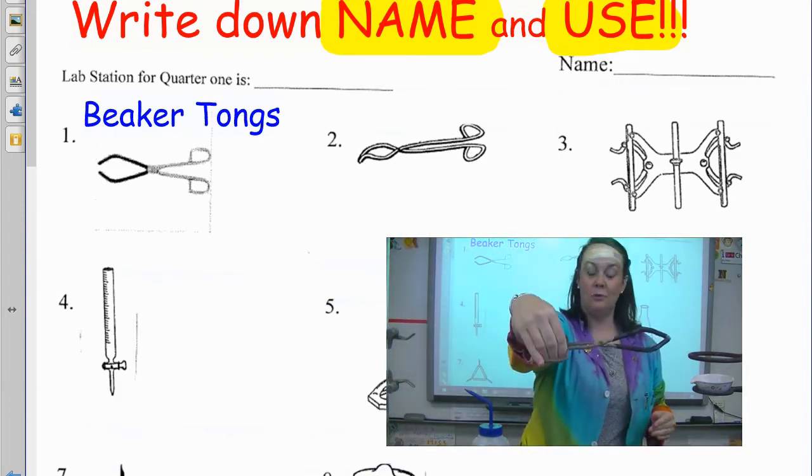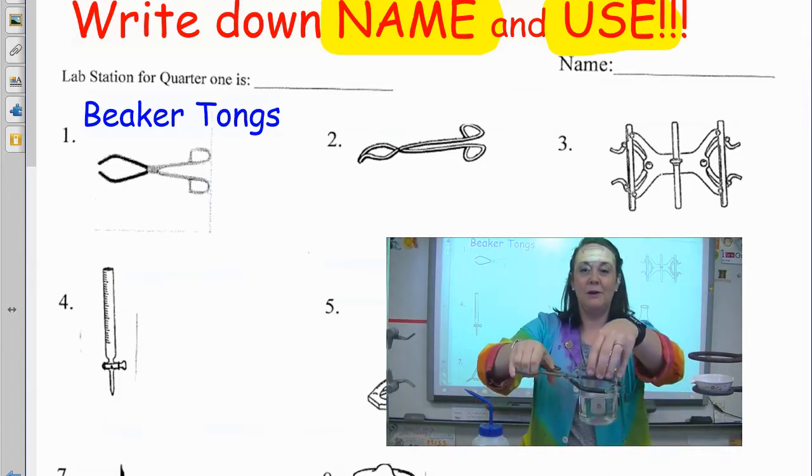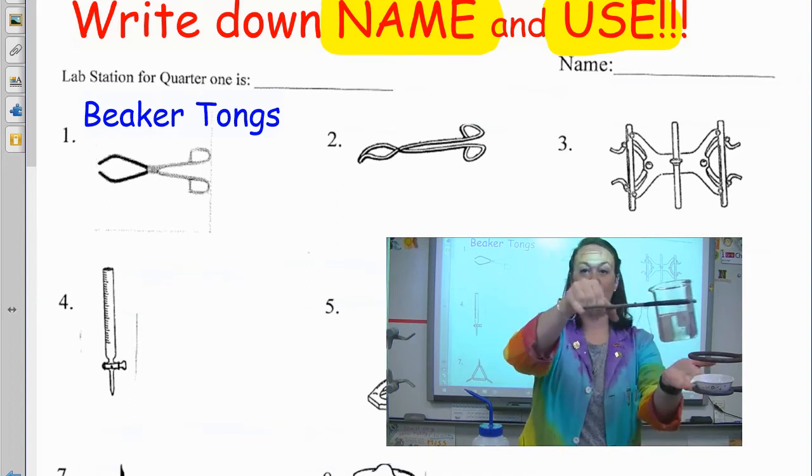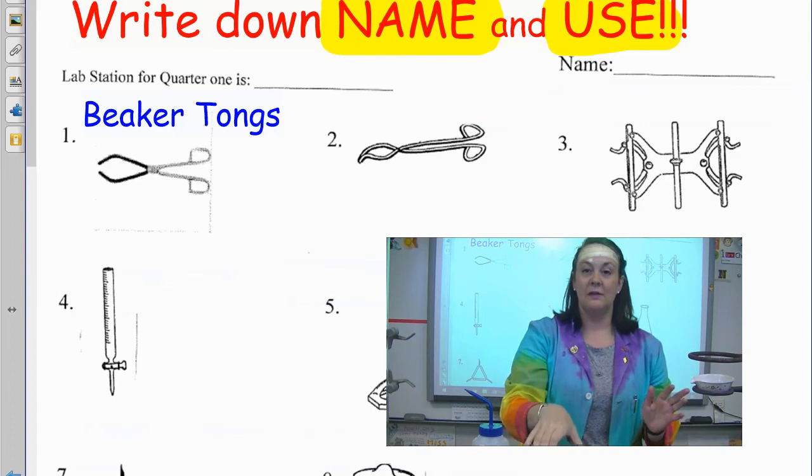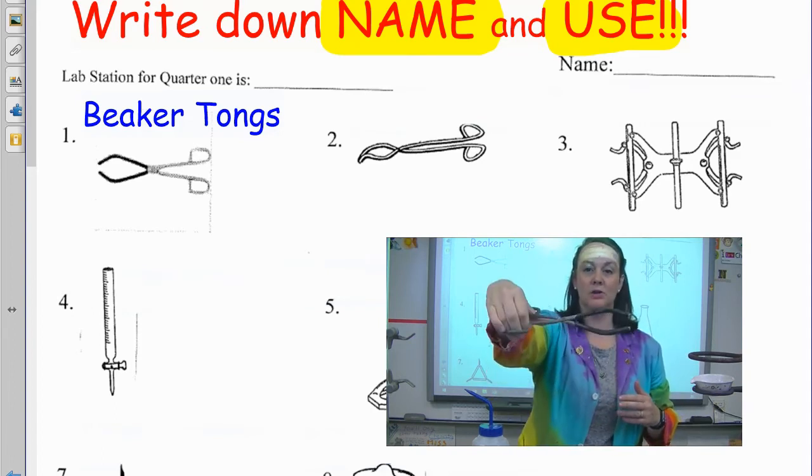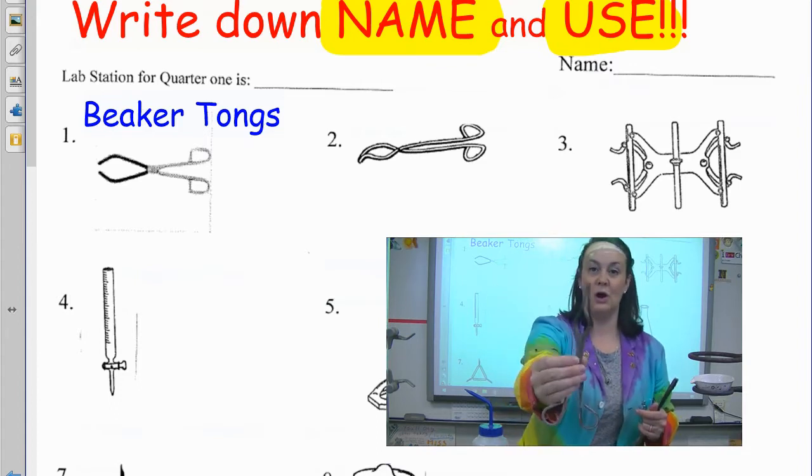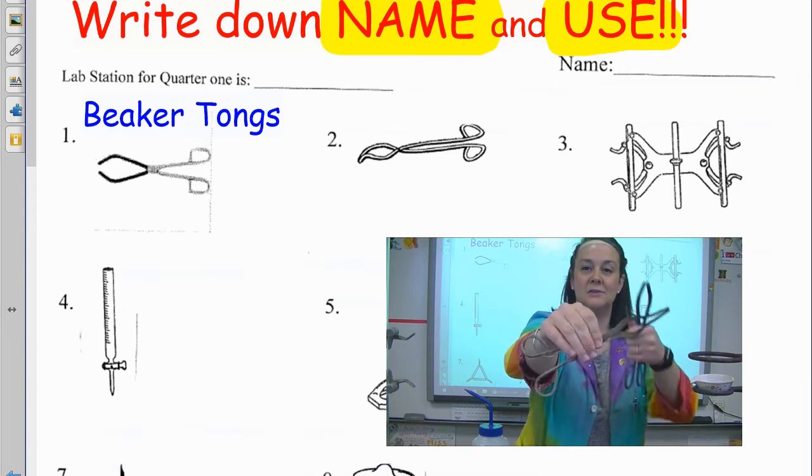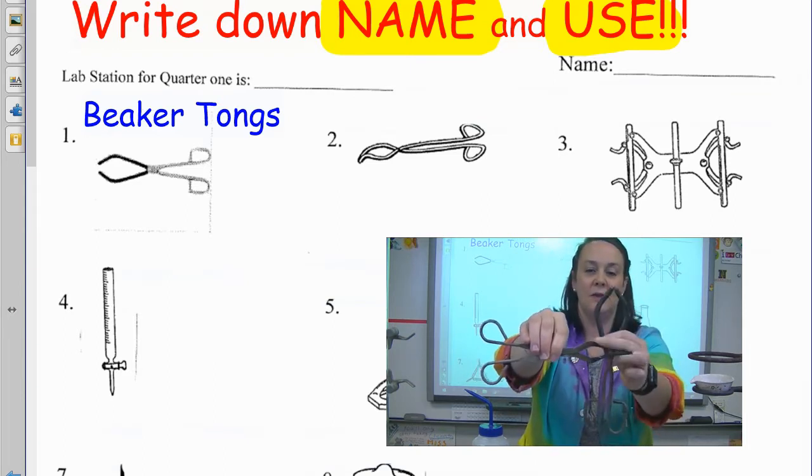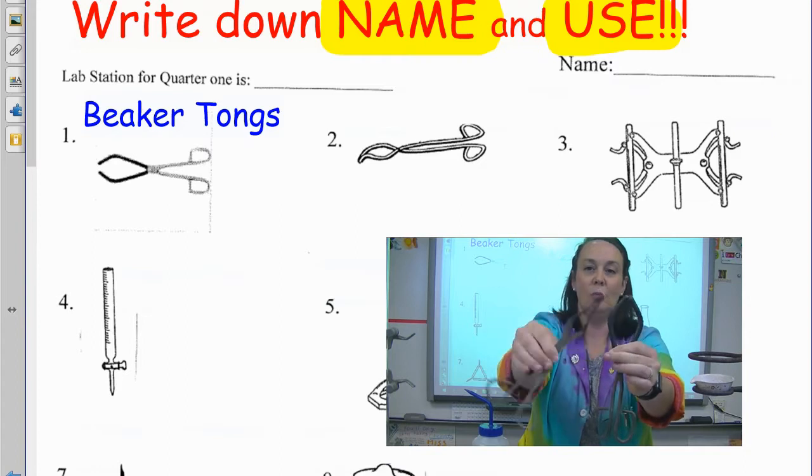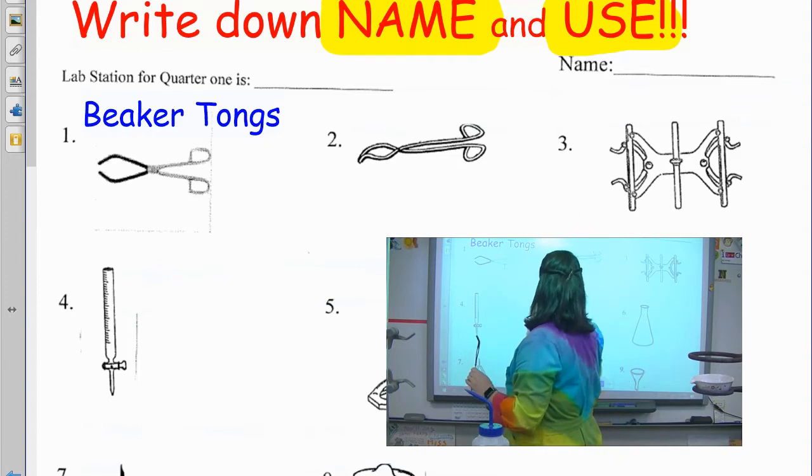And what beaker tongs are for, which tongs, the same thing that you use in your kitchen and beaker tongs are to hold hot beakers, whether you're removing them from a ring stand after you've been boiling water, things like that. So you hold hot beakers with beaker tongs. These are not to get confused with crucible tongs. The thing about crucible tongs is that they do not have any of the plastic coating on the outside. They look a little bit different. They have just a smaller opening than the beaker tongs without the rubber. So these are called crucible tongs.